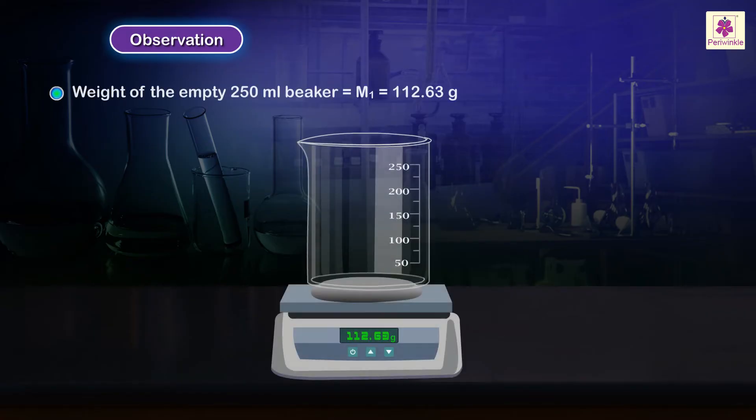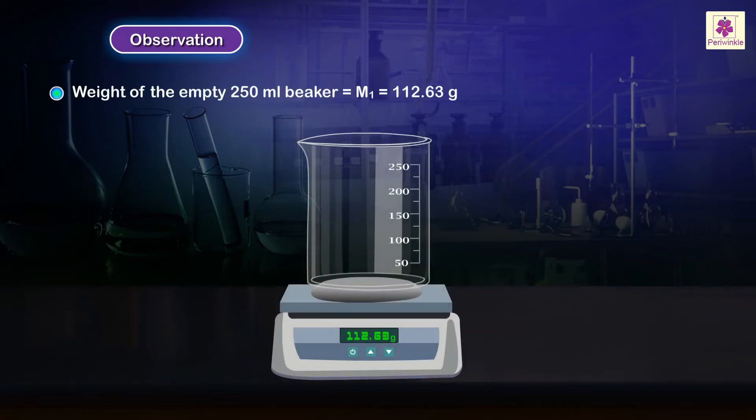Observation: Weight of the empty 250 ml beaker is equal to M1, which is equal to 112.63 grams.